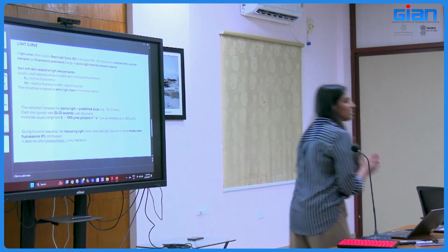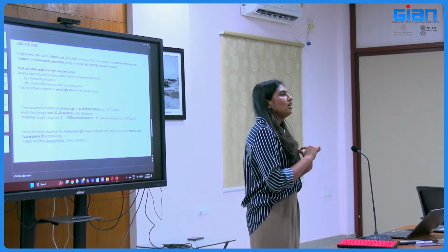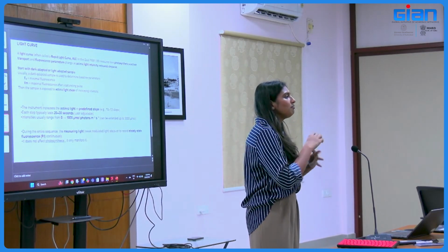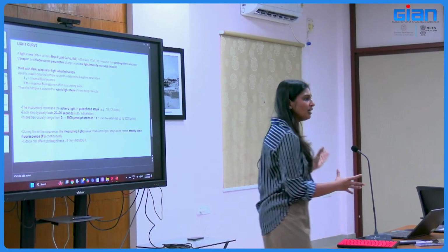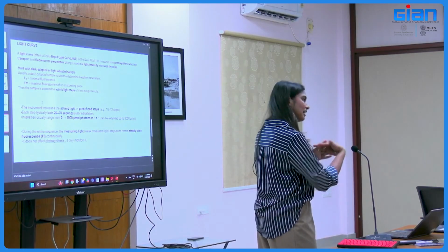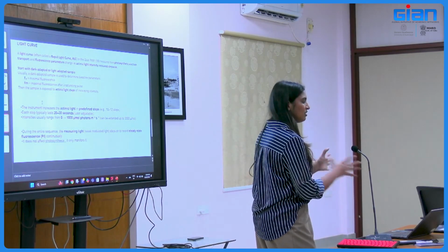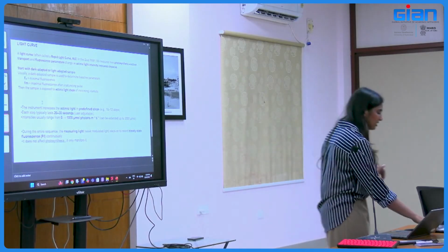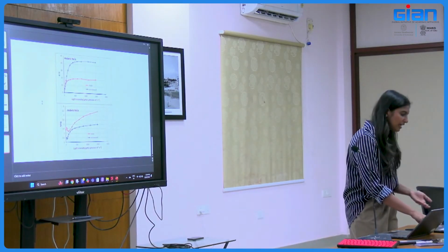You are going to get the electron transport rate, the PS2 yield, and what is happening with the PQ pool. The signal will be amplified and you will get all these results from a single signal.